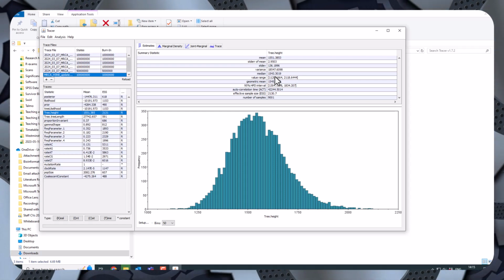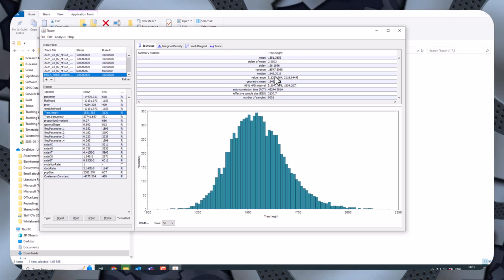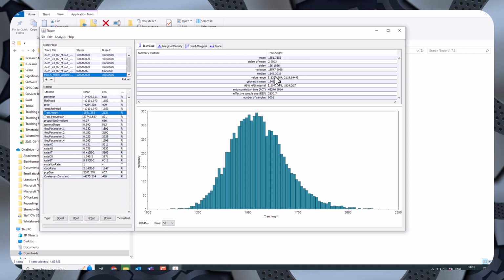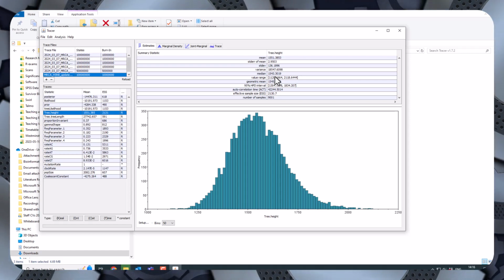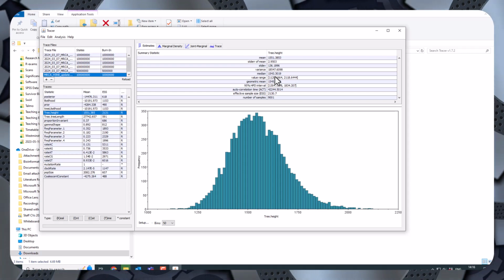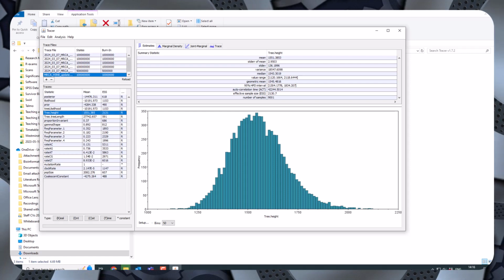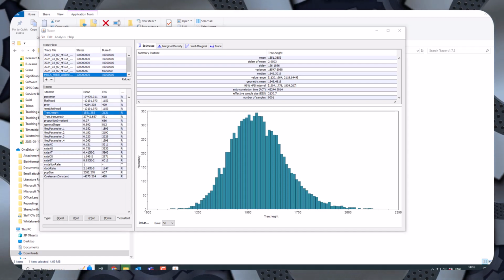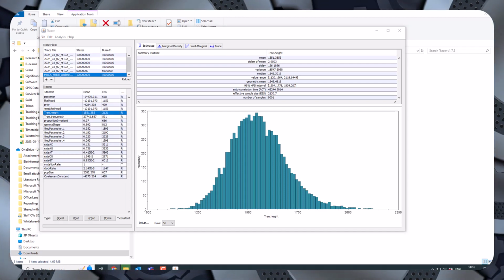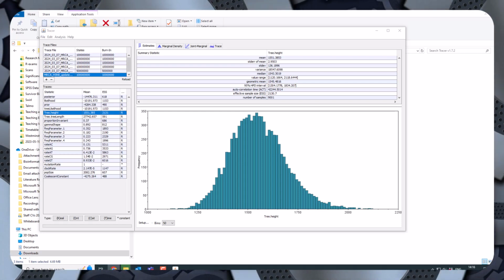Now what I was expecting is that if you got an outbreak, the originating event which created it would happen quite close to the outbreak itself. So with COVID, we first detected there were examples of COVID, and we had the first 100 cases that we detected in 2019.